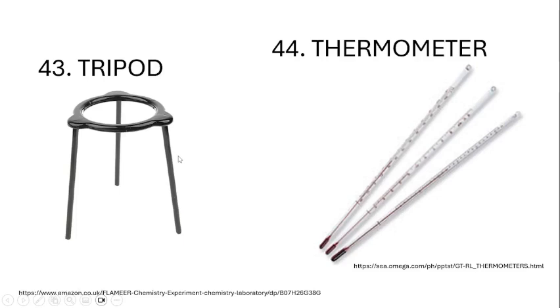Next is your tripod. It is a stand made of lightweight metal to provide a stable platform during heating. I have not yet encountered an actual one, but usually a clay shield is used, and the iron ring, and then sometimes it's the alcohol lamp or sometimes the Erlenmeyer flask. So I haven't encountered yet a tripod being used.